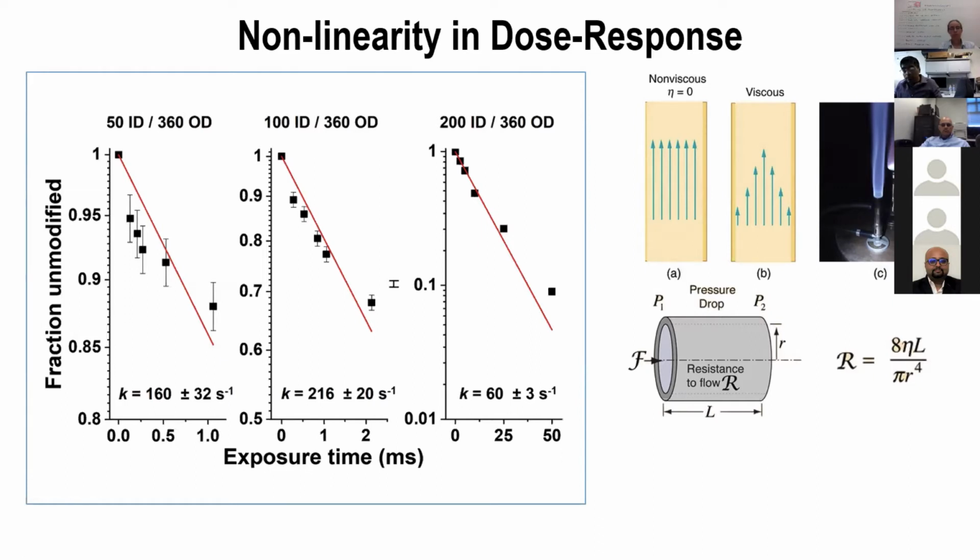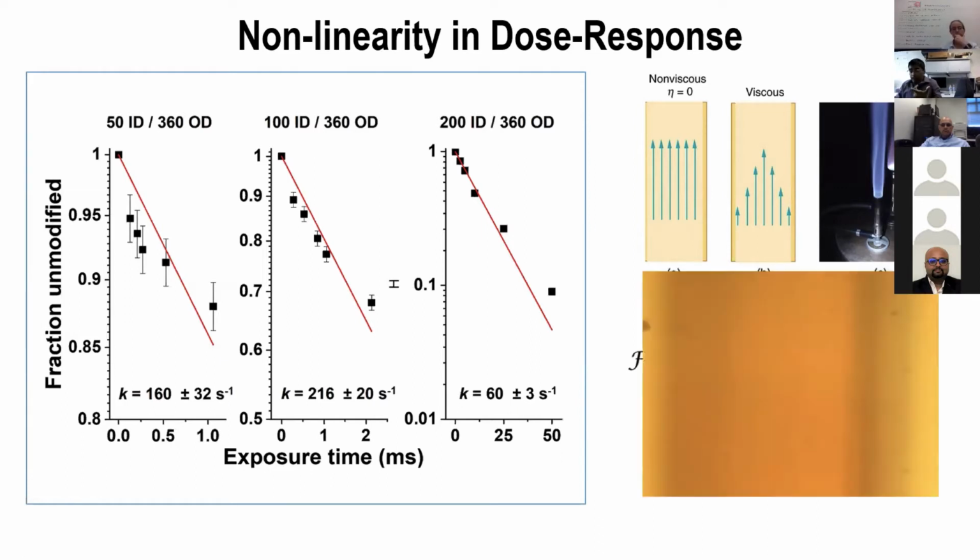We calculate the rate. Here I can show one example of what happened when you put this capillary in the high focus beamline. You can see the burning coming from the side. You see the blackening start from one surface and kind of cover the other surface. This is the problem with the capillary flow. We cannot go for a very high dose. After this burning is done, the sample will be charred or damaged and then clog. So it's a huge problem.